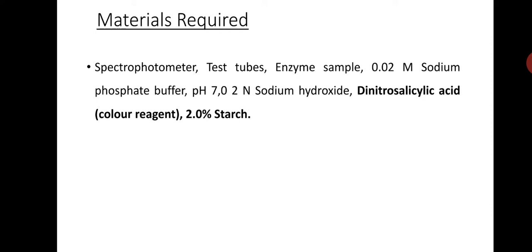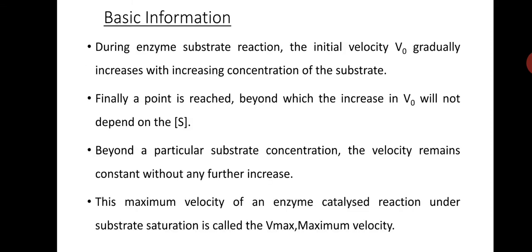And starch. See, when you are using amylase, it means the substrate for this amylase is starch, which is a polysaccharide, a carbohydrate. Okay, so you are going to take this in the concentration of 2%. Fine. And amylase, as I already told you, is present in your saliva.